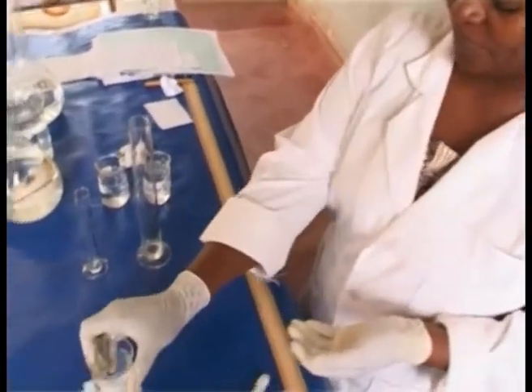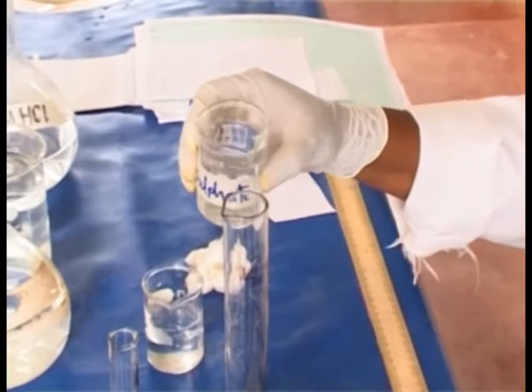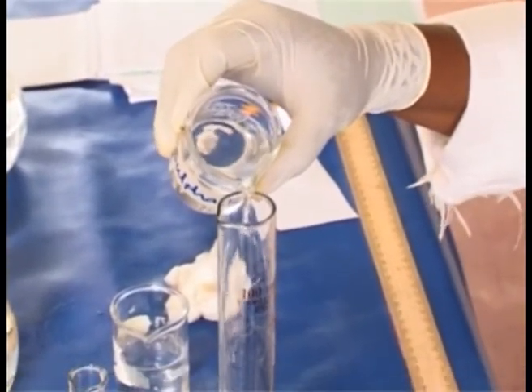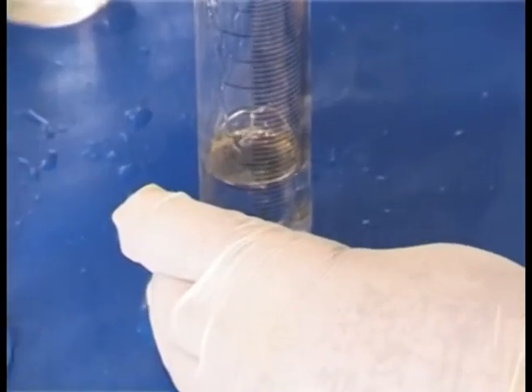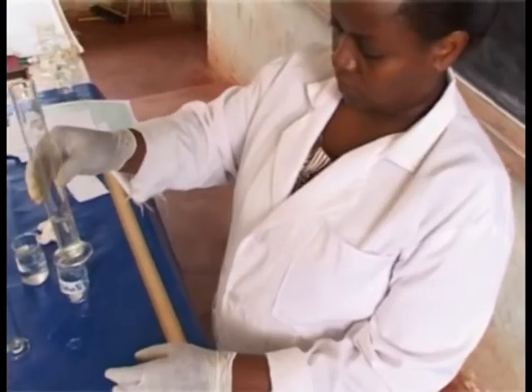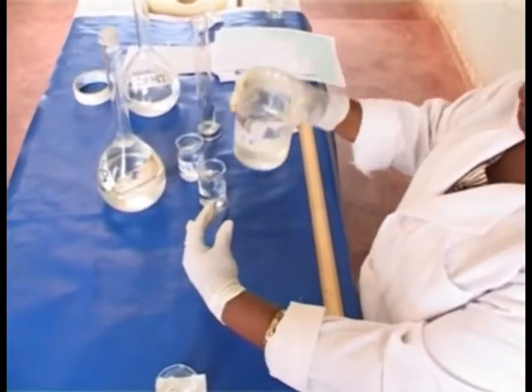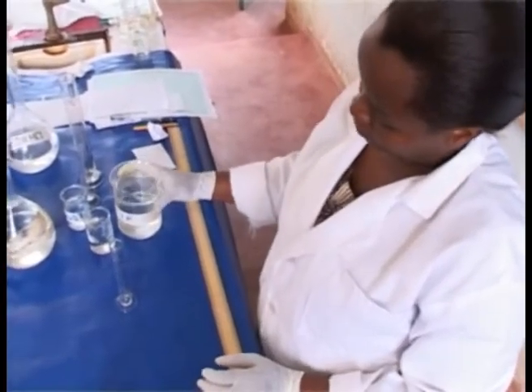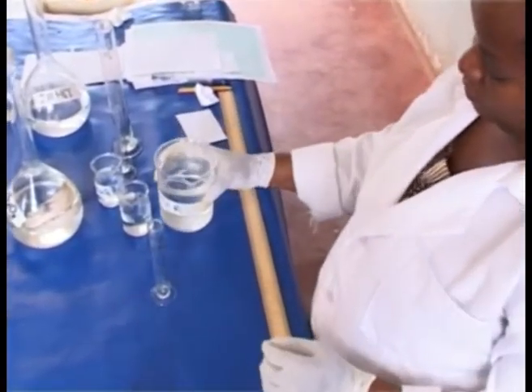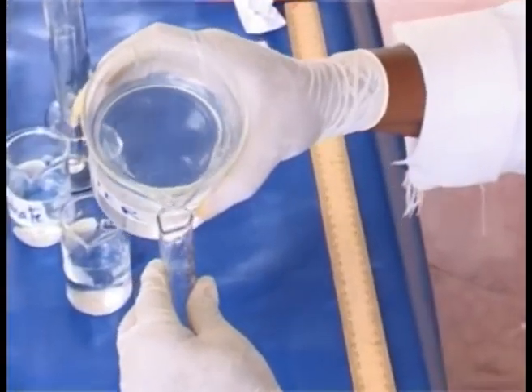Take beaker M, measure 25 milliliters of sodium thiosulfate, and transfer 25 mils of sodium thiosulfate into beaker M. Take distilled water and measure 5 ml of distilled water.